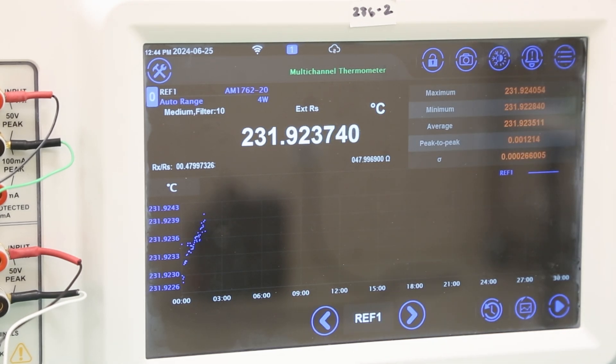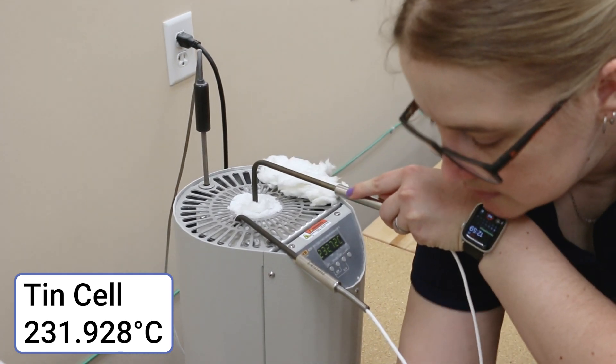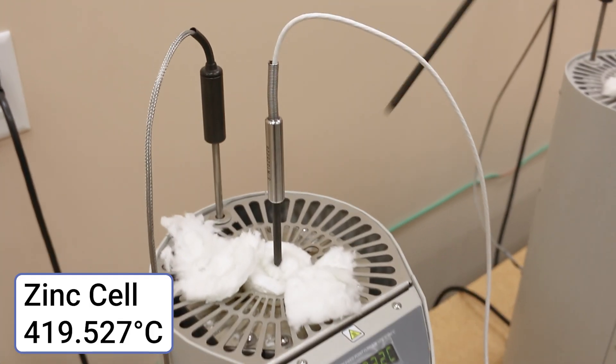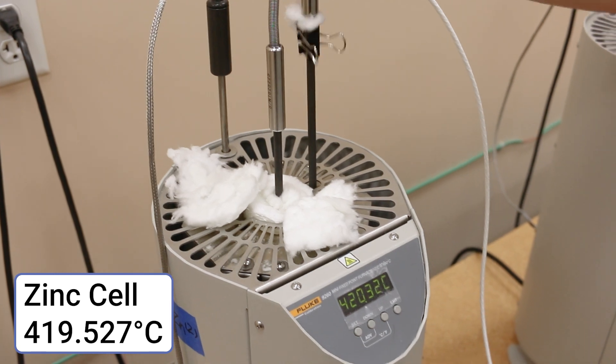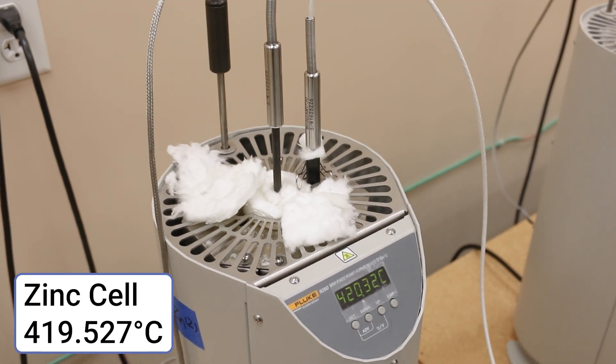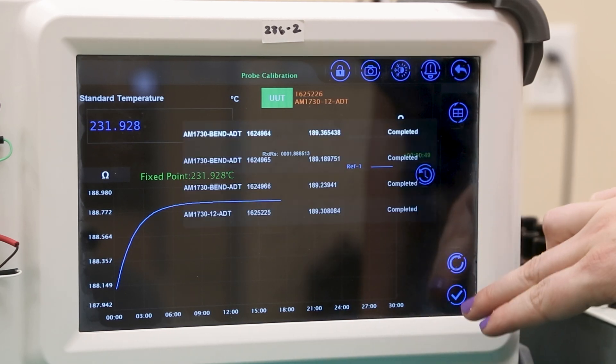Once readings have plateaued, we can move probe 1 from standby into the active insert, then return to measuring probe number 3 in the zinc cell. It's important for a calibration lab to determine the optimal order of measurements, stability checks, and standby probes in order to reduce downtime as much as possible.